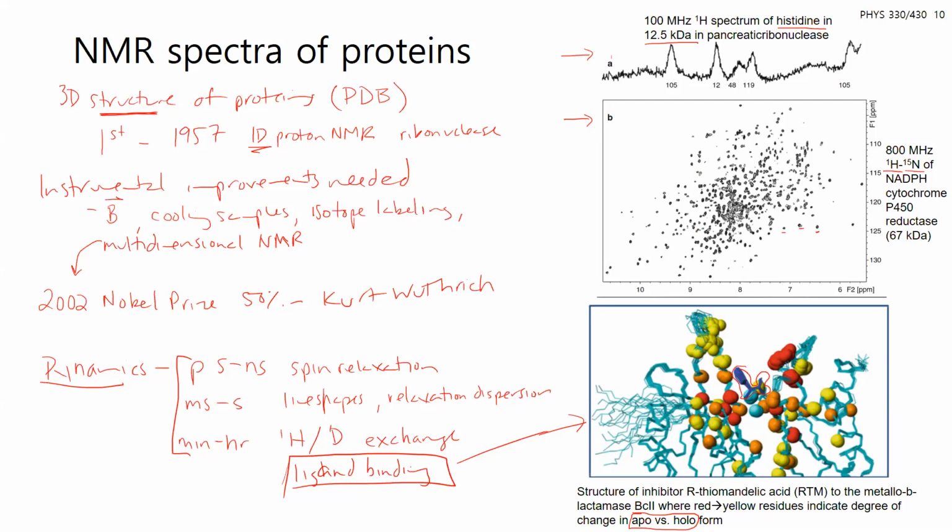With this experiment, they probably did measurements of two separate solutions of the apo and holo forms of the protein. But again, this time scale process, you can look at these changes over time as you introduce a ligand to your solution. And similarly, you can look at proteins associating with one another. So there's lots of dynamics going on there.